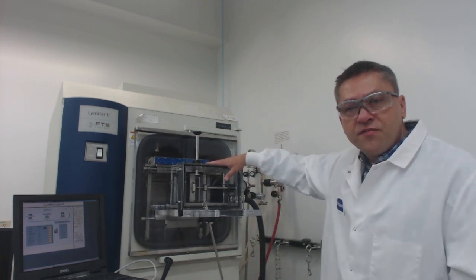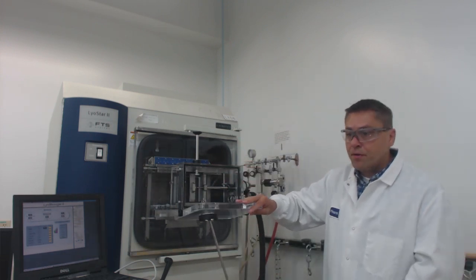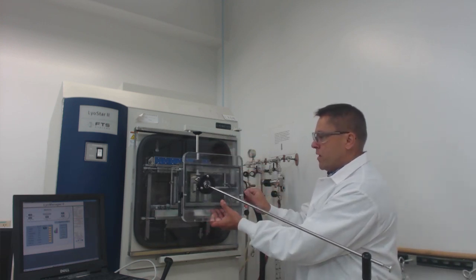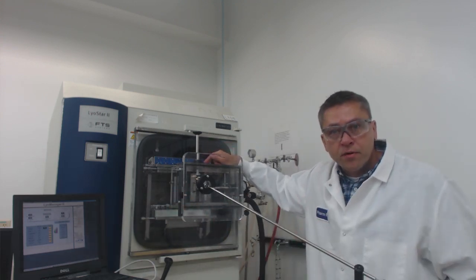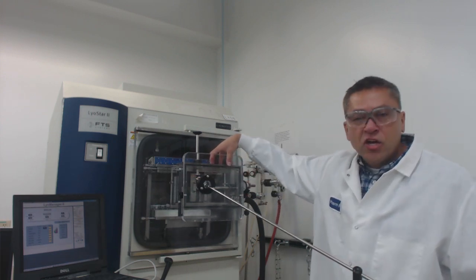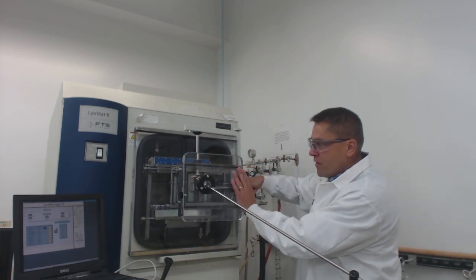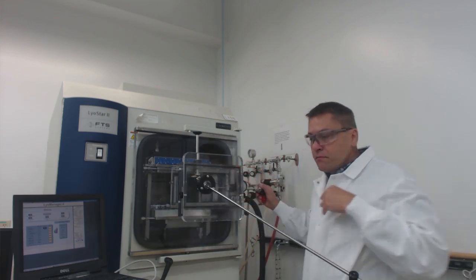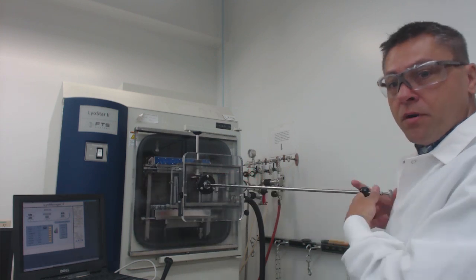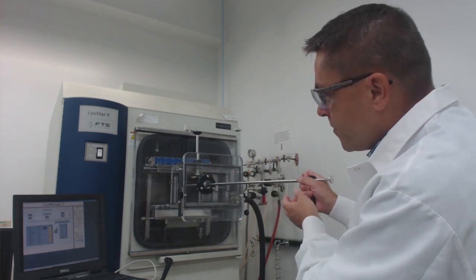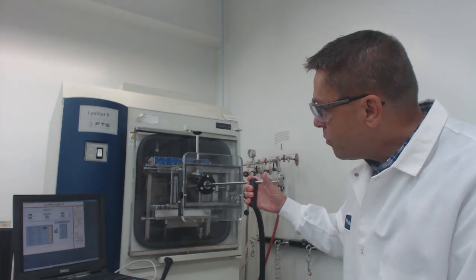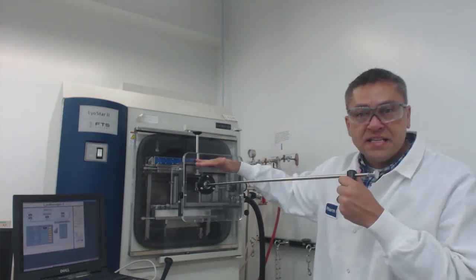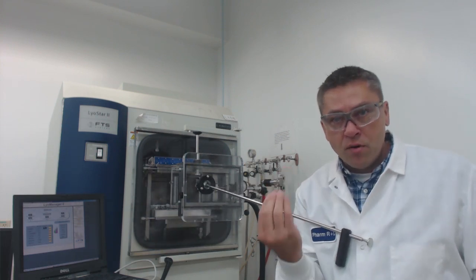One method of doing that is this thief sampler. This thief sampler has a door on the front. We can seal it into place, and there's a door in the back that goes directly to the chamber. We can then pull a vacuum on this external box until we can open the inside of the chamber. When we do that, we now have access to the internal part of the chamber. We can then reach this arm with a little grabbing device on the end. We could reach in there, pull a sample, pull it out, seal it, and then have a sample captured at that point of the process representing the certain residual moisture.